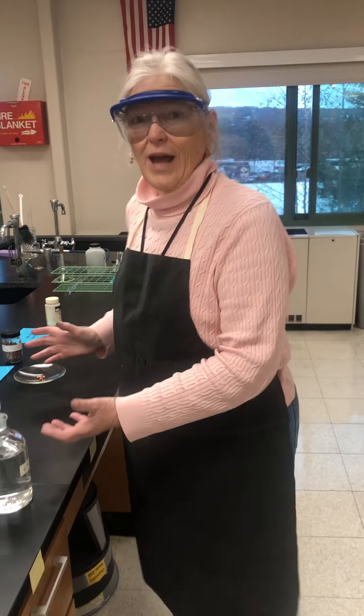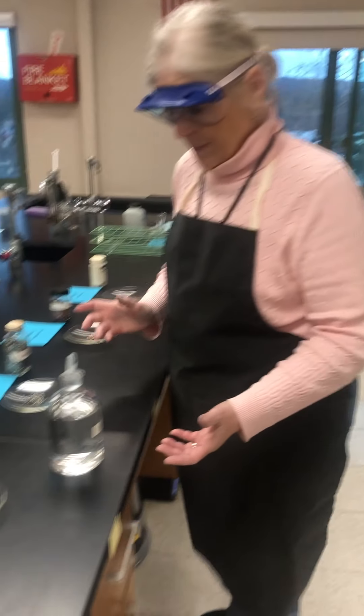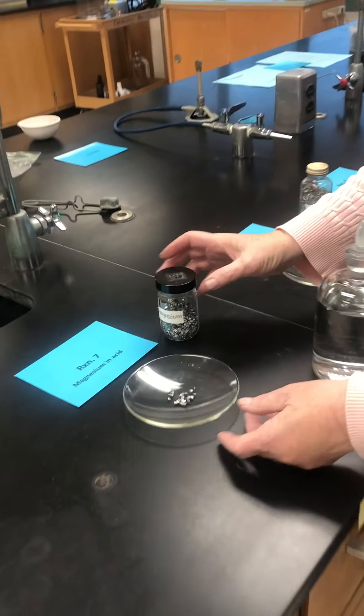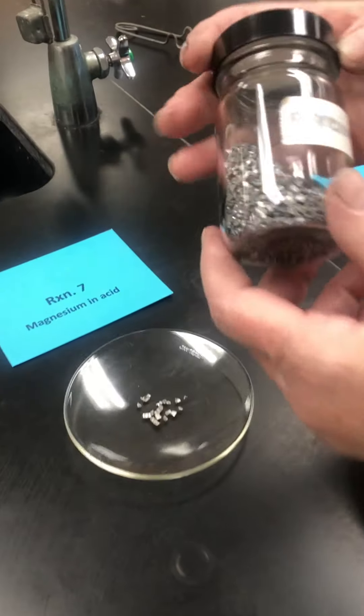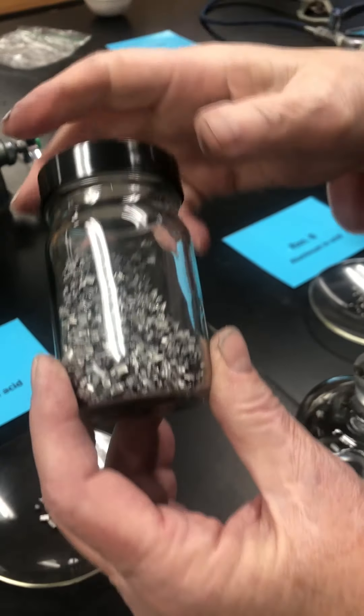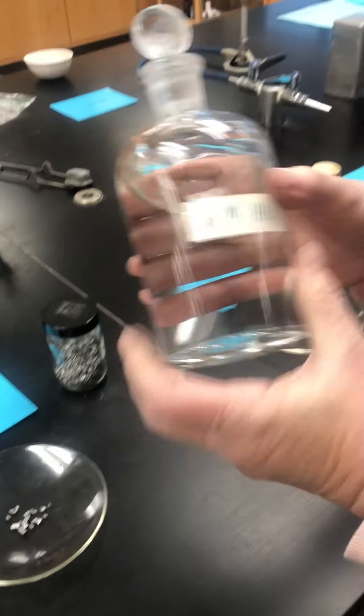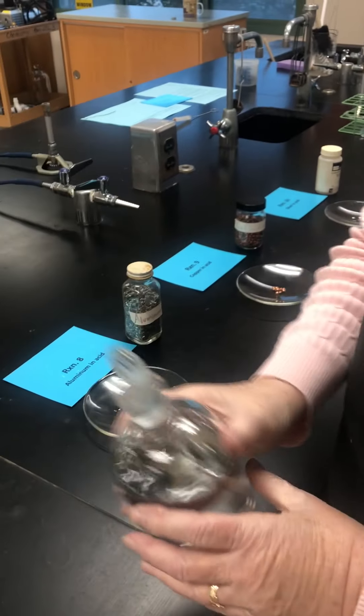Here I'm doing four reactions at the same time. Reaction seven is going to be magnesium, and here I have magnesium chunks, not ribbon, into which I'm going to pour six molar hydrochloric acid.